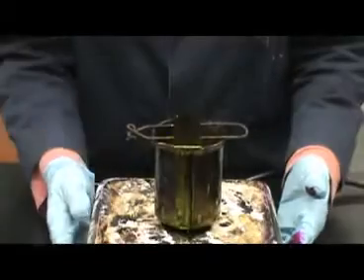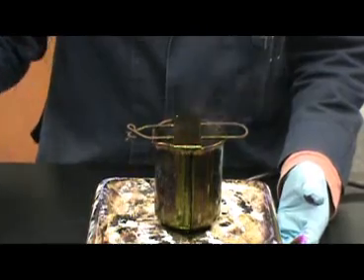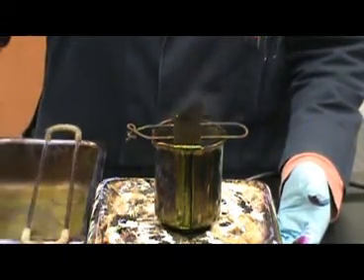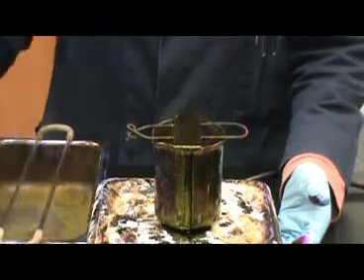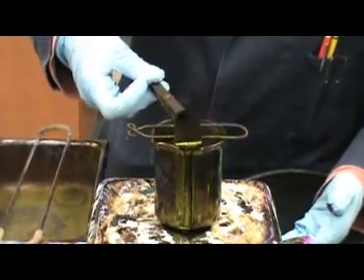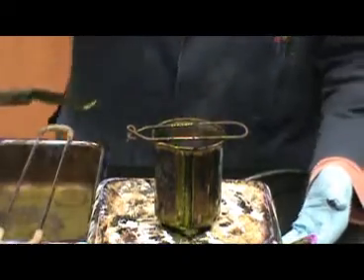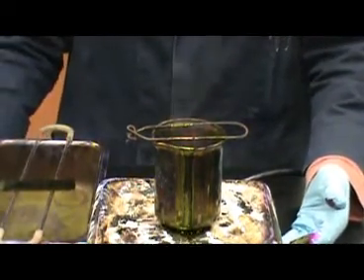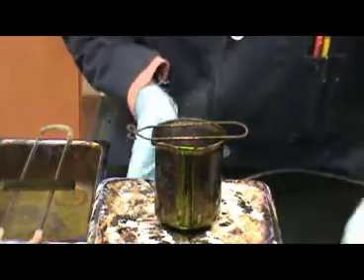For acid-fast staining, the Ziehl-Neelsen method requires the steaming step. Another acid-fast stain method, known as the Kinyoun method, does not require steaming. However, the carbol fuchsin contains a higher concentration of phenol. Once the steaming step has been completed, the slide is removed and placed onto a staining tray.